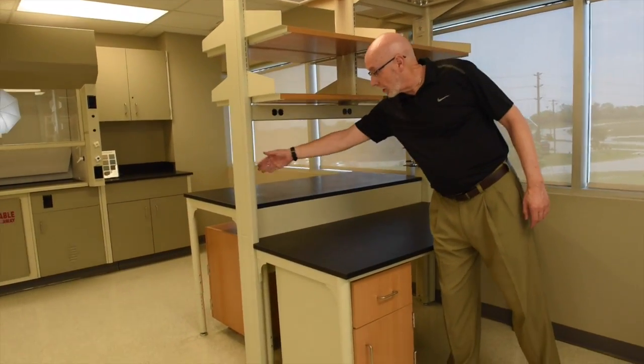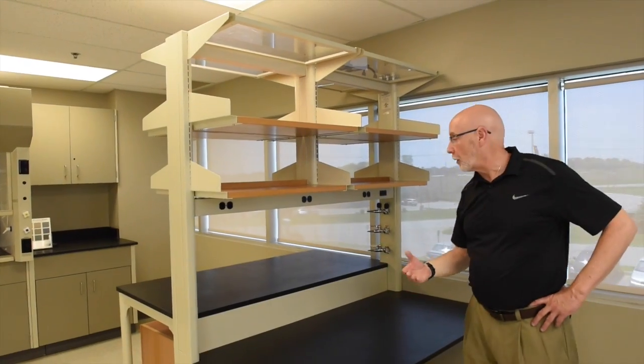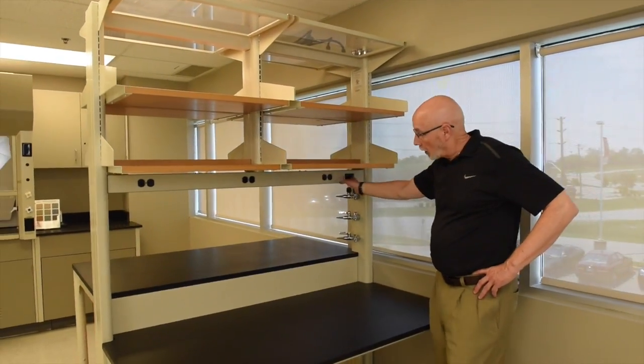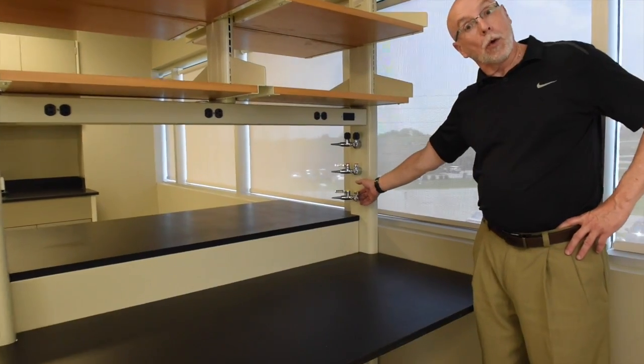You can see that it is a double-sided unit. It's 84 inches high. It's what's called a plug-and-play type unit. You'll see that you have your electrical and data in this horizontal piece going across just above the worktop, and then you have your fixtures in the post.